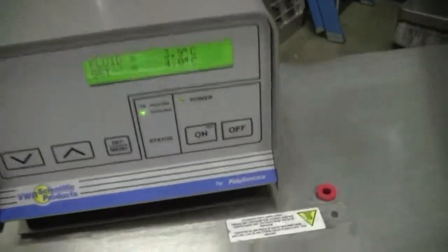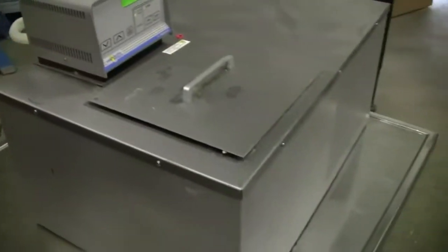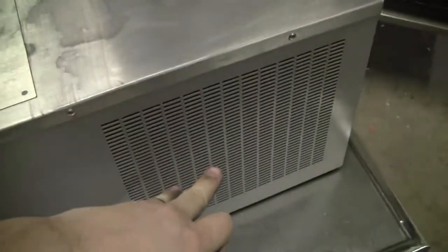It's holding quite nicely at 4 degrees. Reservoir is on this side. Compressor is on this side.